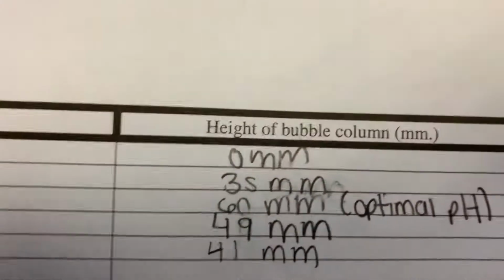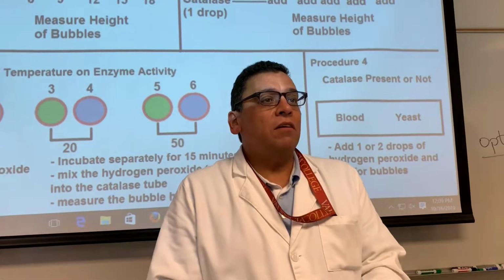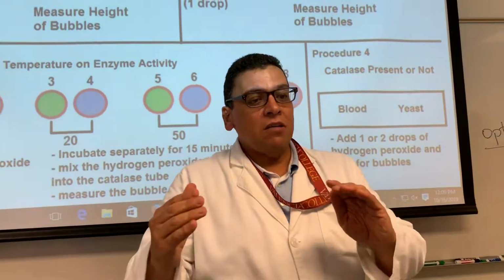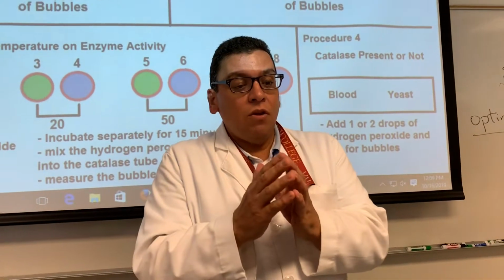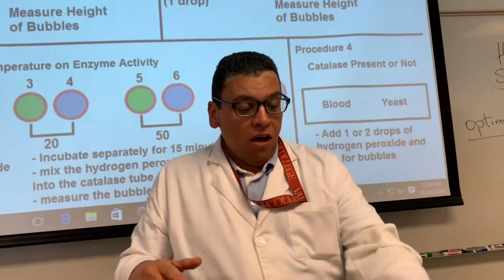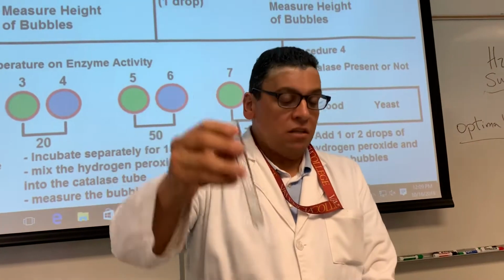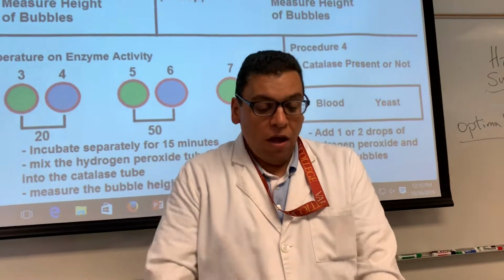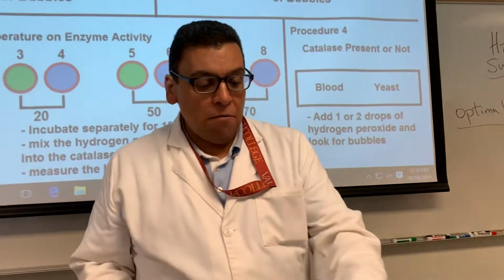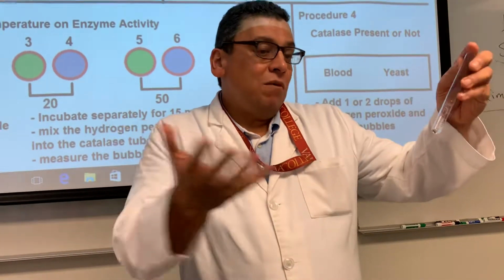So that means hydroxide or hydrogen ion concentration has something to do with that as well. Yes. It's just a pH of 7. Don't worry about the hydrogen and hydroxide. They are equal, so they're not hurting the enzyme at all. The hydrogen on this one is hurting the enzyme. The hydroxide in pH 11 is hurting the enzyme by denaturing it. At pH 7 they're equal and they're not affecting the enzyme. Why? Because the enzyme is active.